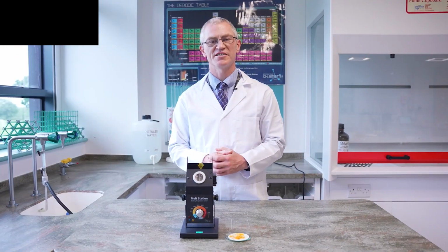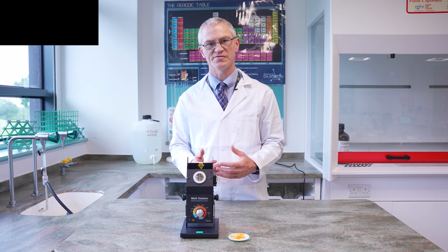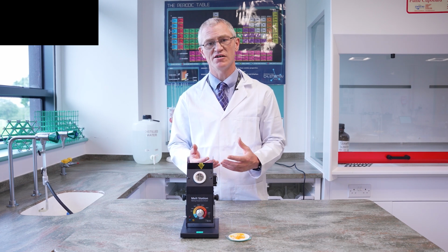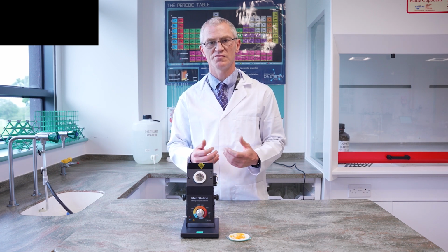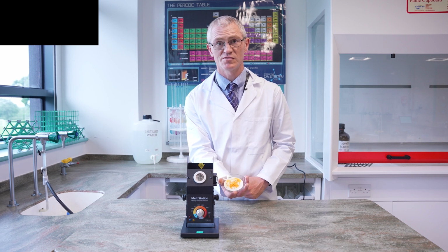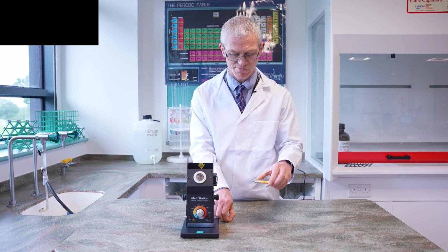We're now at the last stage where we identify our 2,4-DNPH derivative. Then we can know what the ketone or the aldehyde was at the start, because there is a database online which shows you the exact melting point of derivatives of different aldehydes and ketones with 2,4-DNPH. And we have our product here, our nice orange precipitate, and that orange precipitate can be loaded into a melting point tube.